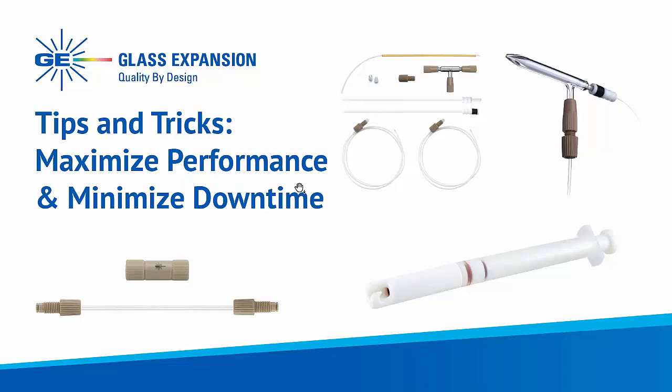So today I'm going to talk about maximising performance and minimising downtime of your ICP.